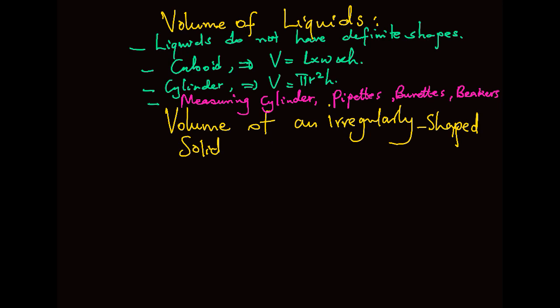When using devices like a measuring cylinder, we must also try to avoid errors by ensuring that the eye is in level with the bottom of the meniscus.